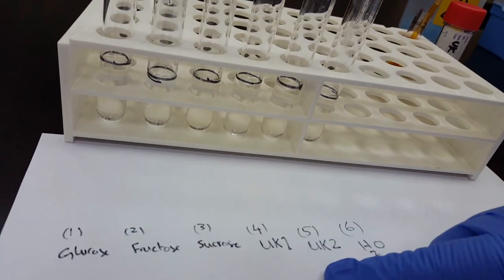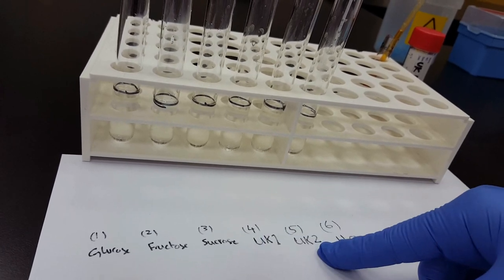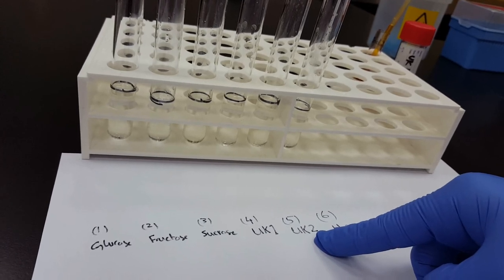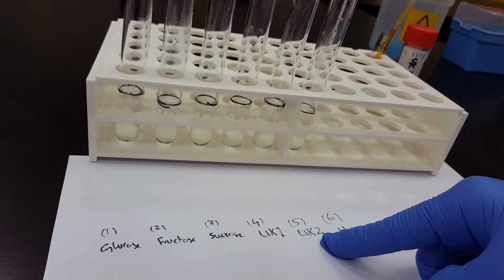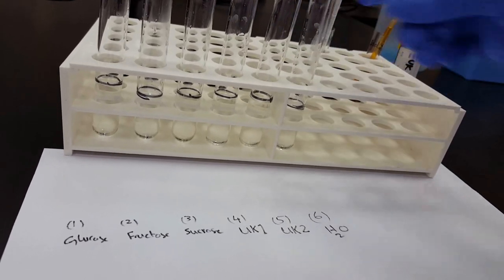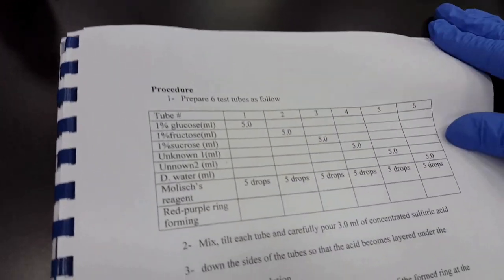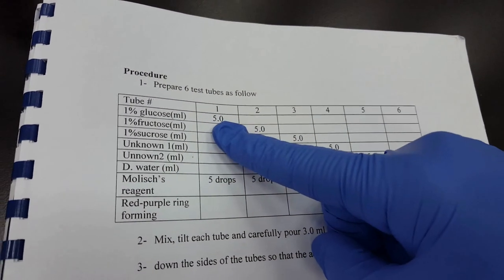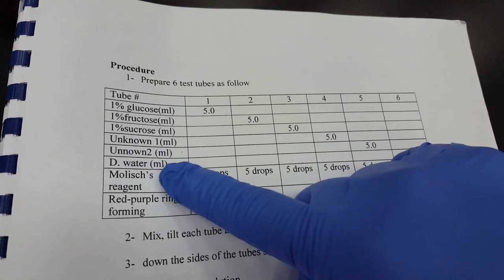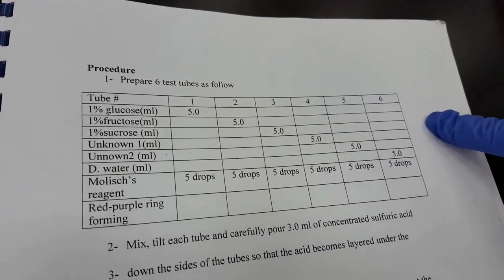The fourth and fifth tubes are our unknowns, so we need to find out in unknown one and unknown two whether it's a carbohydrate and what type of carbohydrate. Is it a monosaccharide, a polysaccharide, or a disaccharide? The sixth tube has the water. So we will refer back to our table here. We have to add 5 ml of glucose, fructose, sucrose, unknown one, unknown two, and the distilled water to those 6 different test tubes.